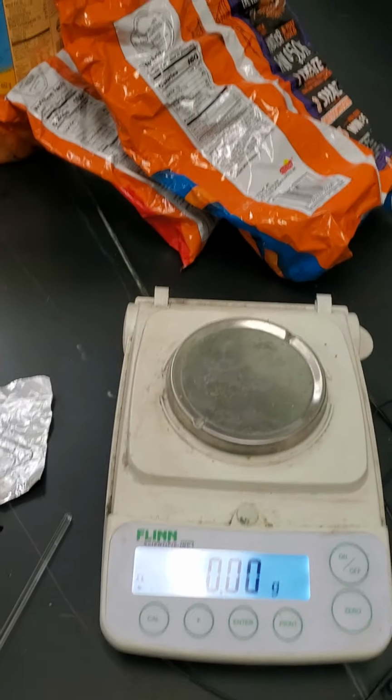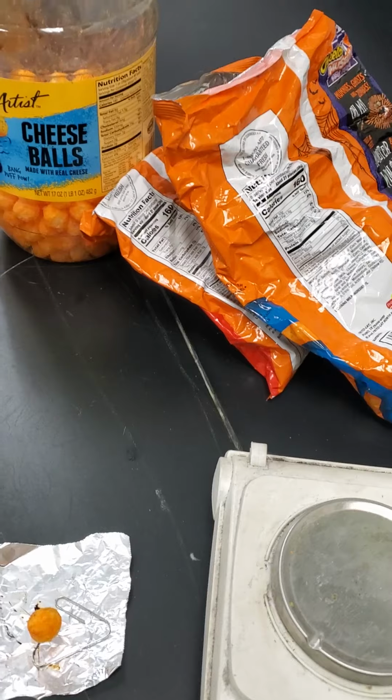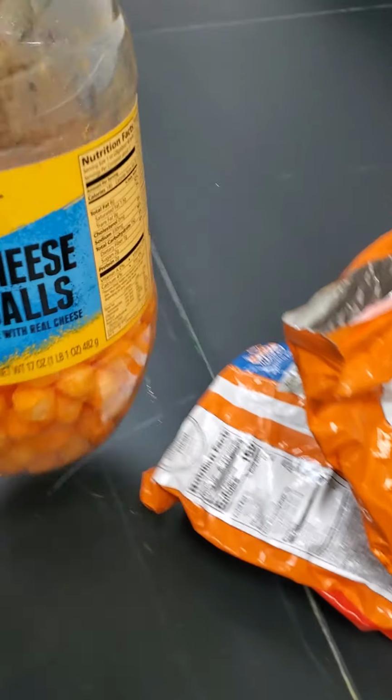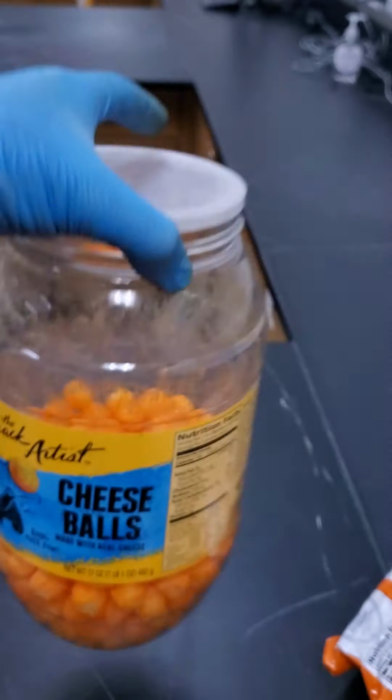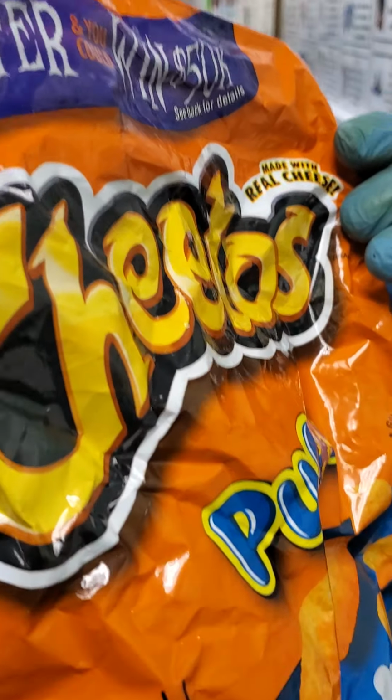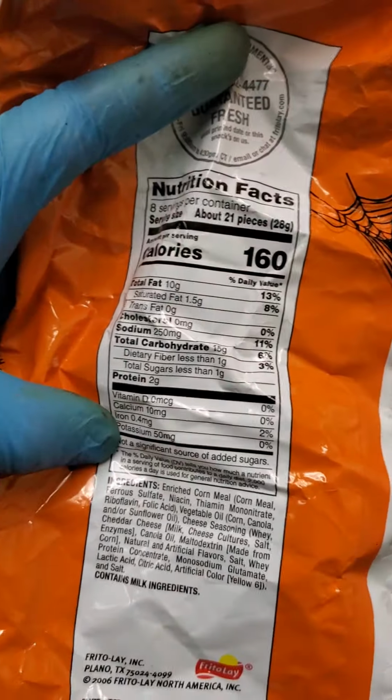Okay, today we're going to do a lab looking at the heat of combustion of various Cheetos. And we have three types of Cheetos. We have cheese balls here. We have the cheese Cheeto puffs, with this being the nutritional information.